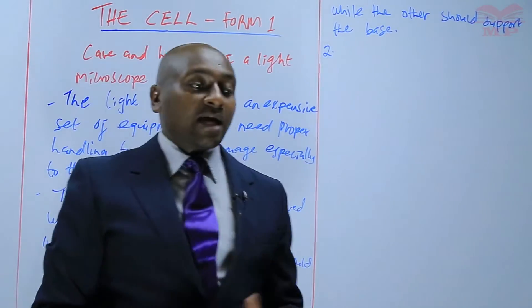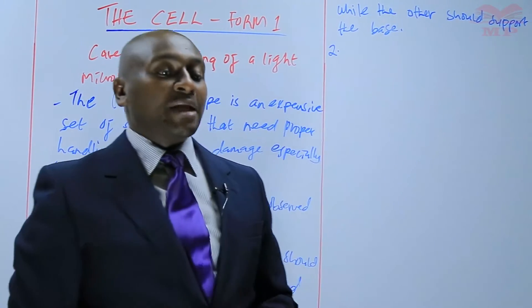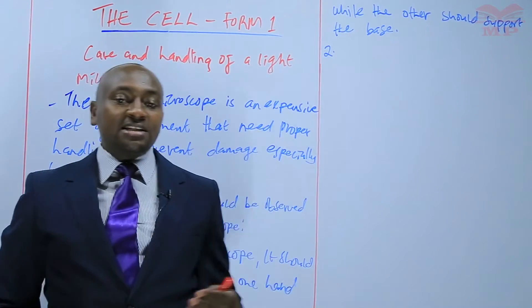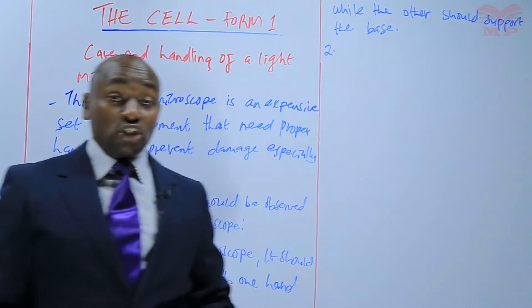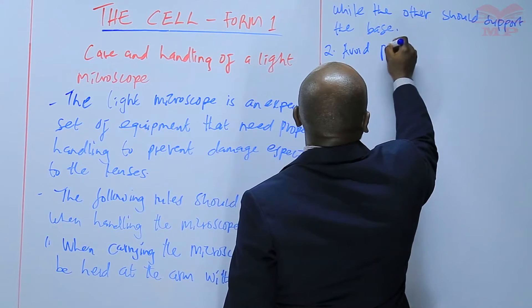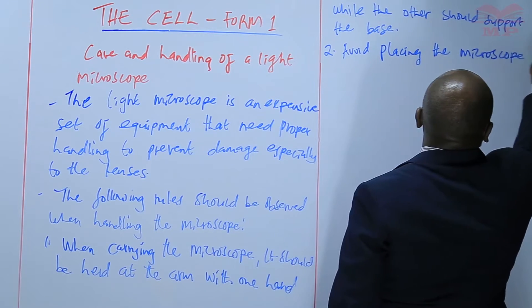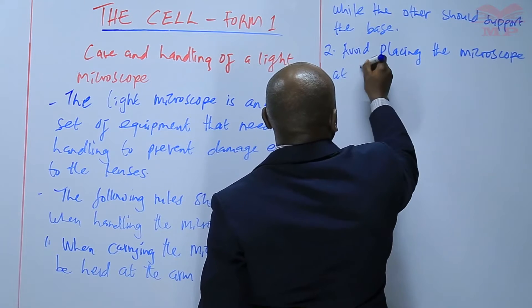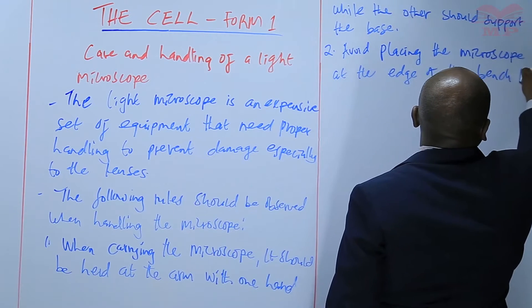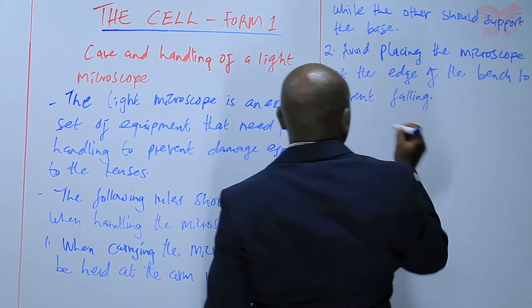Number two: after carrying the microscope to the bench where you are going to use it, make sure that you do not place it near the edge of the bench because it can easily fall. Make sure that you place it somewhere in the middle of the bench. Avoid placing the microscope at the edge of the bench to prevent it from falling.